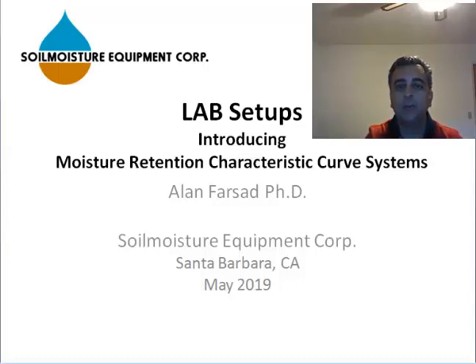Today I am going over soil moisture lab setups. These equipments are used for the moisture retention characteristic curve. It is one of the most important products that we make. We have several product options. People have many questions, so I thought I needed to make this video and go over the basics of our lab setups. So let's jump right in.